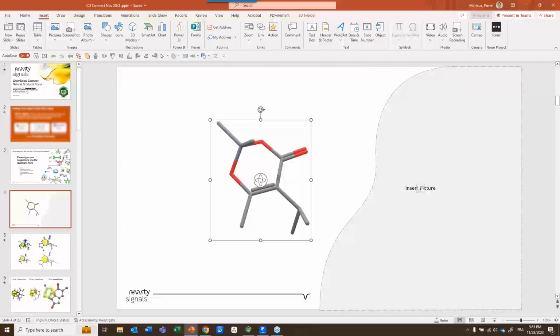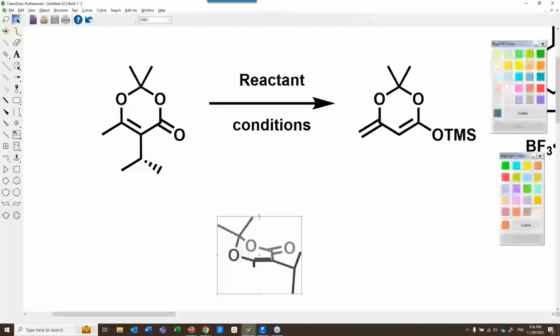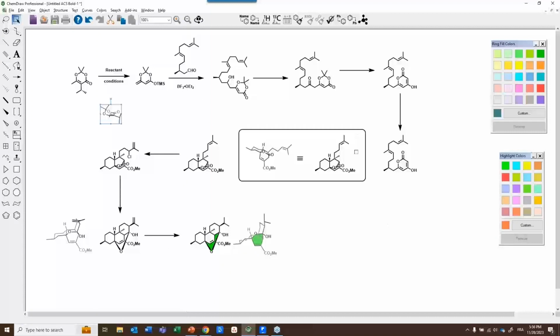Okay, do you usually use cleanup reaction to align the whole synthetic route? If I do this, it's not going to look pretty. We have improvements to make. I would also like that you select everything and you do Control-Shift-X, and then you get the nicely cleaned up multi-step synthesis that keeps the arrows. Right now, it's not going to do that. Right now, it's going to convert it into just one line.